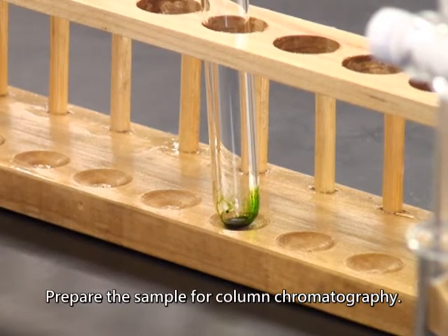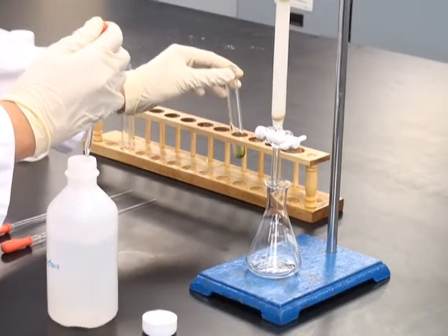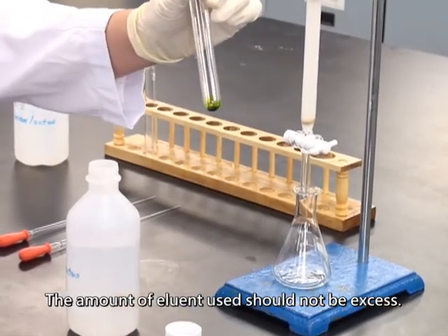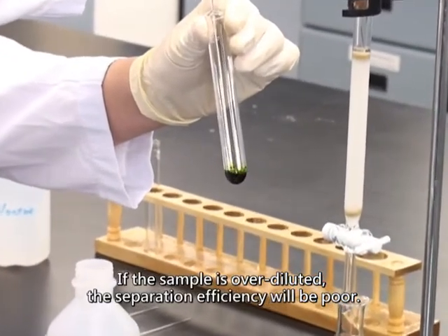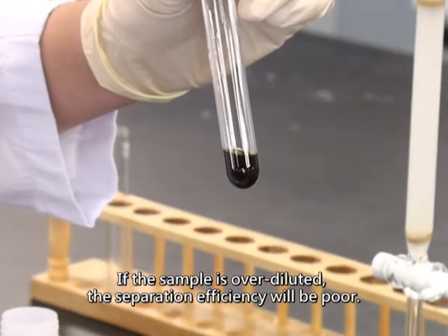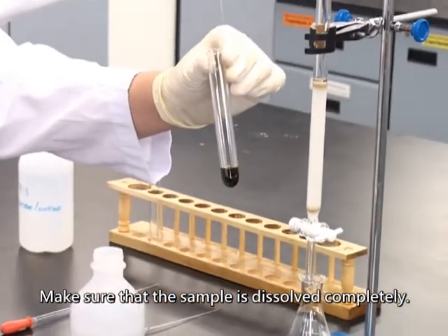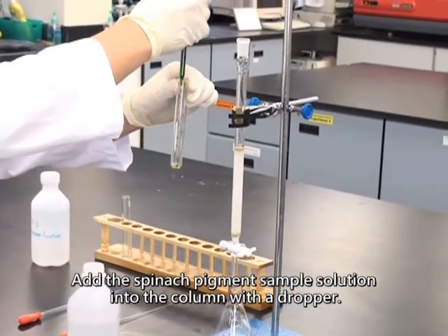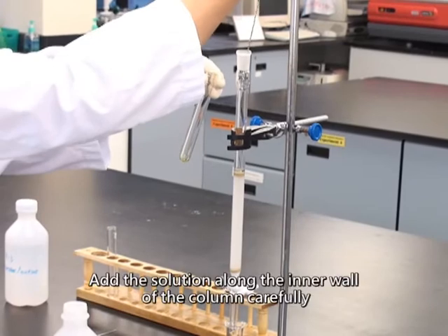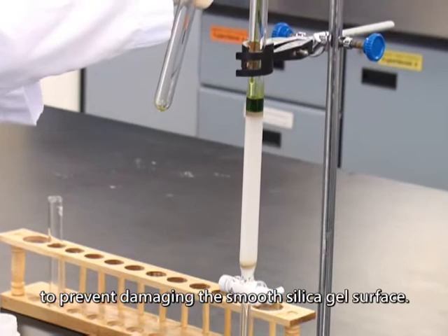Prepare the sample for column chromatography. Dissolve the sample with a small amount of eluent. The amount of eluent used should not be excessive — if the sample is over-diluted, the separation efficiency will be poor. Make sure that the sample is dissolved completely. Add the spinach pigment sample solution into the column with a dropper, adding the solution along the inner wall of the column carefully to prevent damaging the smooth silica gel surface.